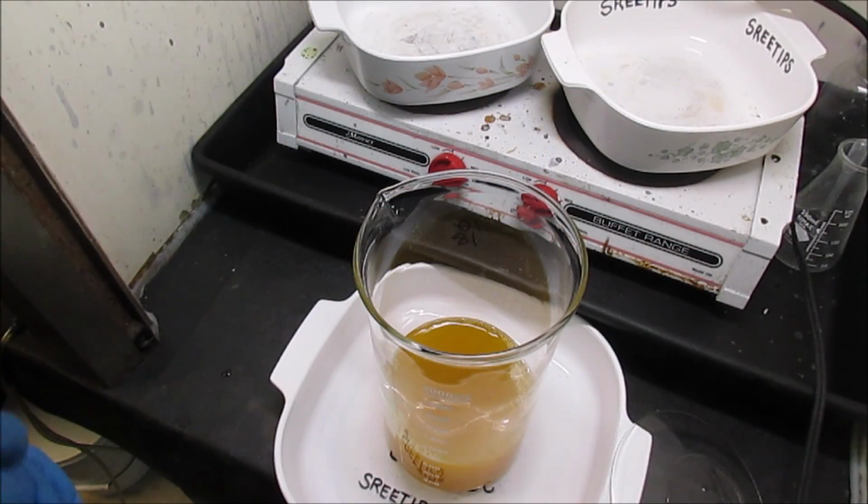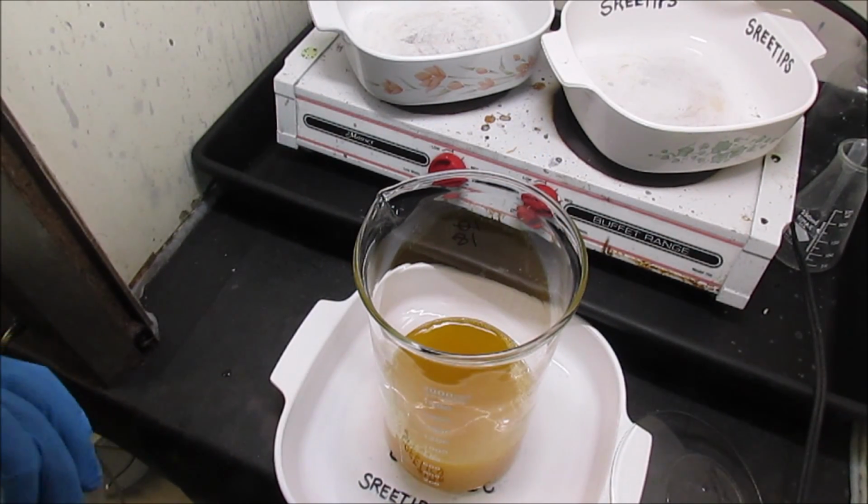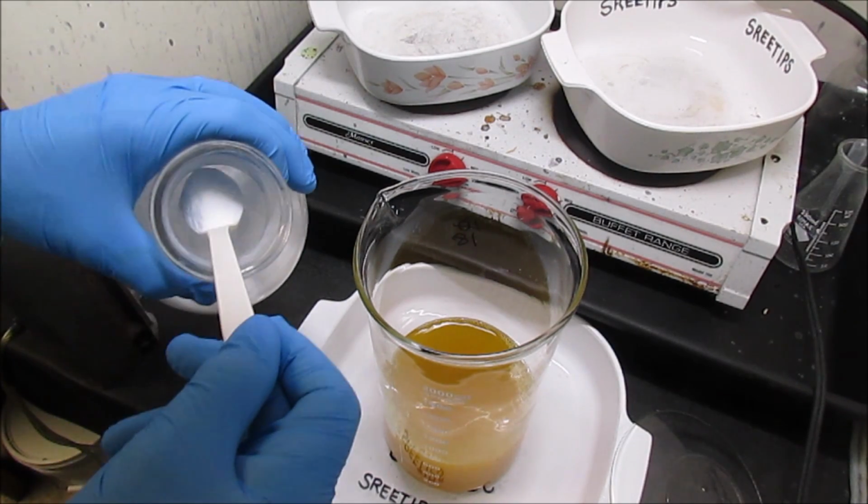Now I'll add some sodium metabisulfite, precipitate out pure gold.